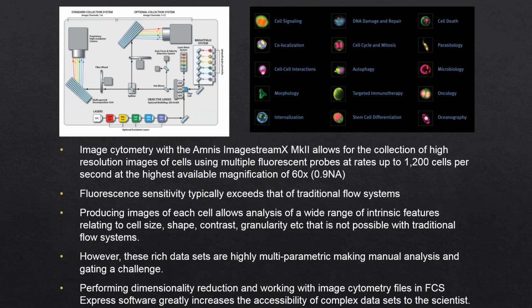We found this to be really useful in some of the work we've been doing with organisms and tissues that are non-mouse, not established model systems. We have a situation where commercial antibodies are not really available, and the community for these model systems is in the process of building up a reagent set. So what we've done is leverage the ImageStream to take advantage of just some cell-intrinsic features, because with bright field and side scatter, you get those for free. You can extract a lot of things from the cells that tell you about their morphology and potentially their cell type.